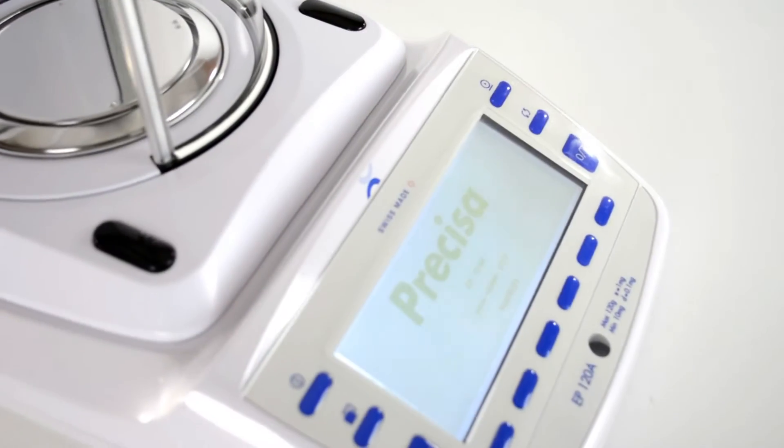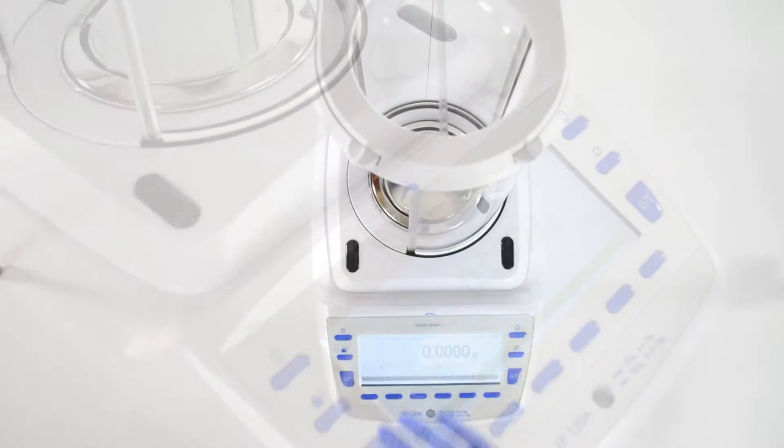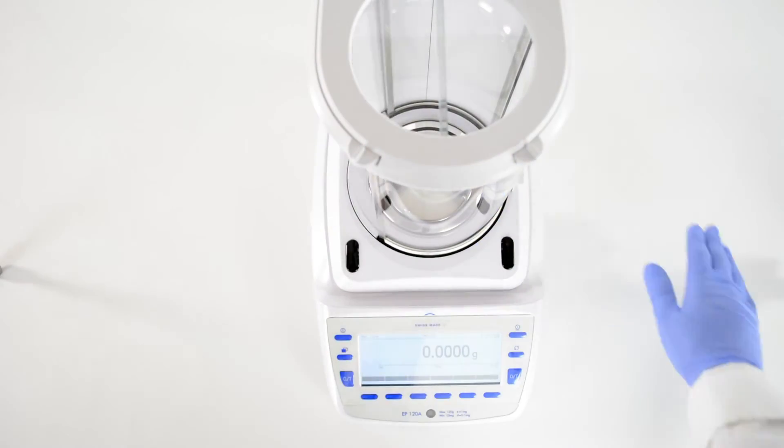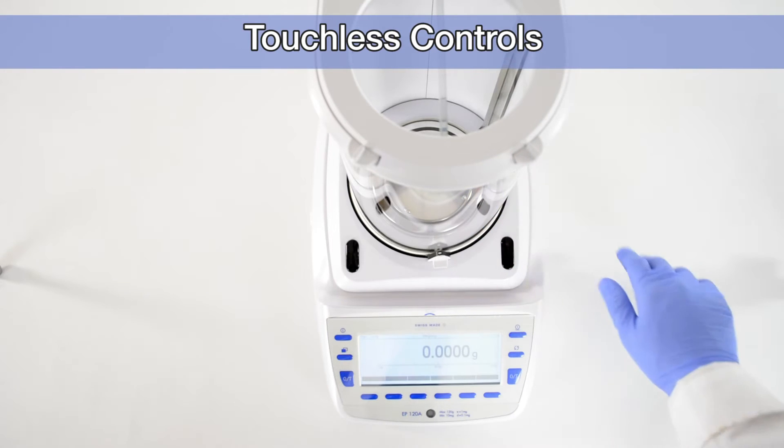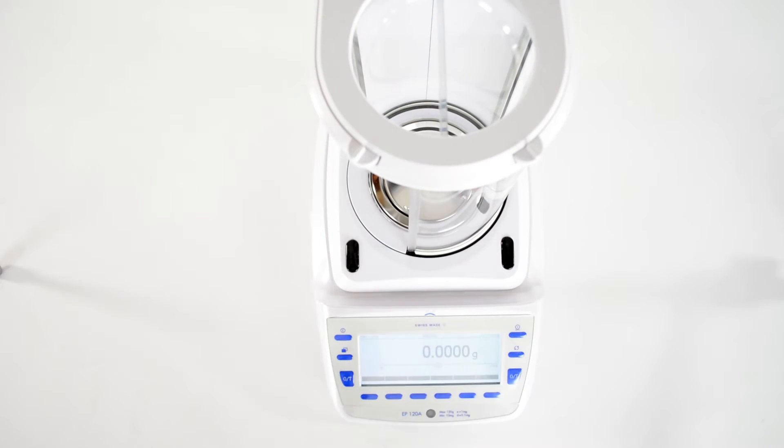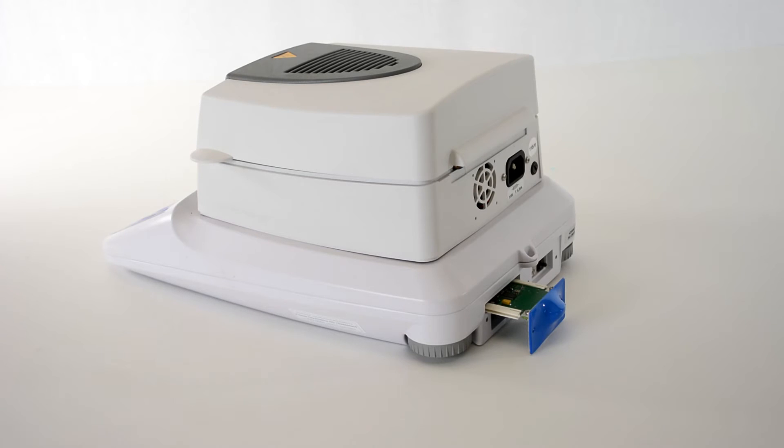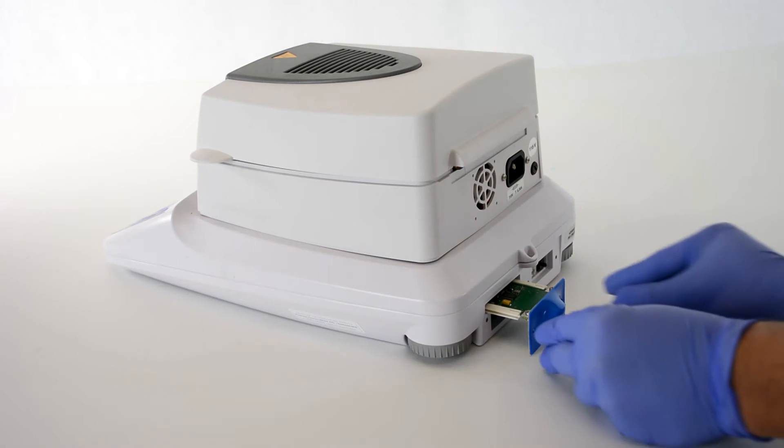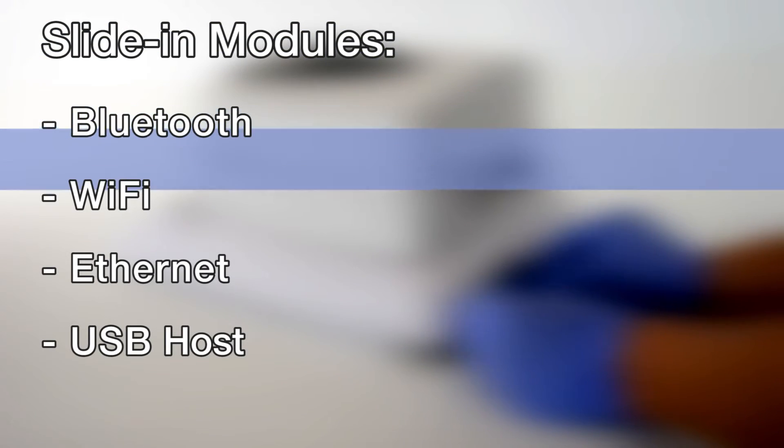The EP includes touchless controls to operate the draft shield with a hand wave for enhanced contamination control. The EP and the EM supports slide-in modules for advanced connectivity, including Bluetooth, Wi-Fi, Ethernet, and USB host.